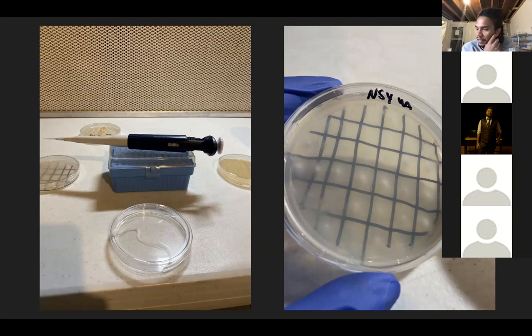Sorry if you hear that fan, it's the PCR running, it's going to be kind of loud. So you're going to want to do water agar. It's literally just 1 liter of water and 25 grams of agar. You don't want a lot of nutrients in this, because it'll make the spores grow out faster, and you want them to grow slow so you can separate them.